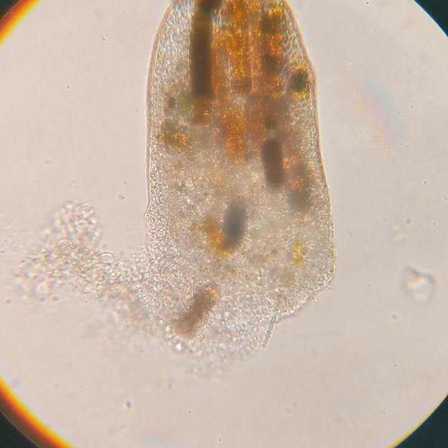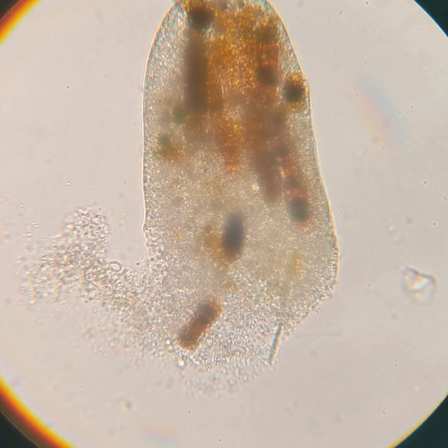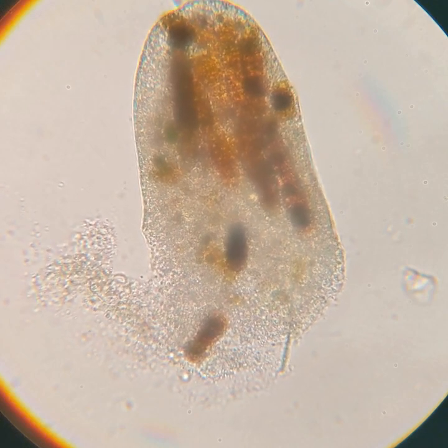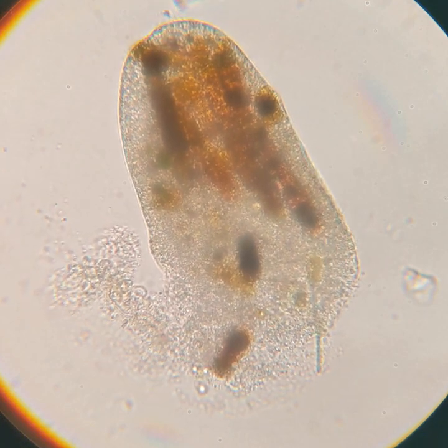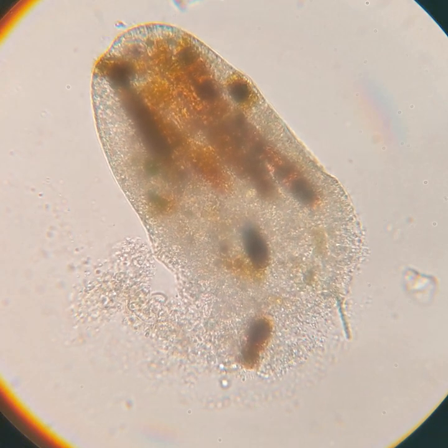While we watch this process unfold, we can talk a little bit about Frontonia species. Frontonia species are closely related to members of the genus Paramecium. However, Paramecium are bacteriovores, which means they feed mostly on bacteria.